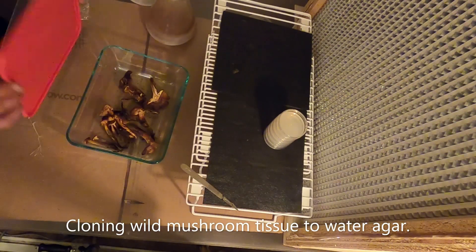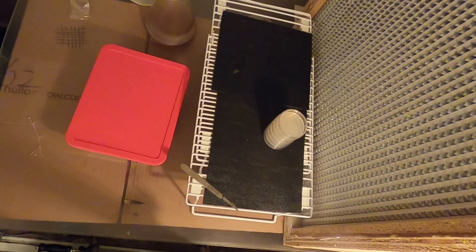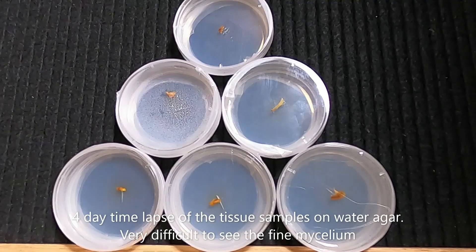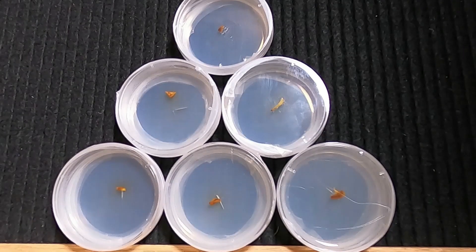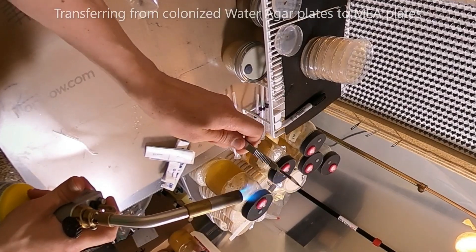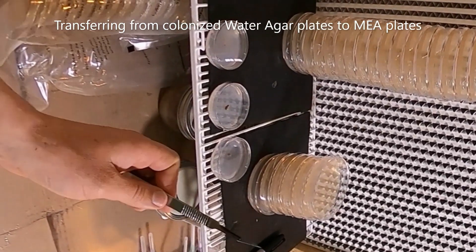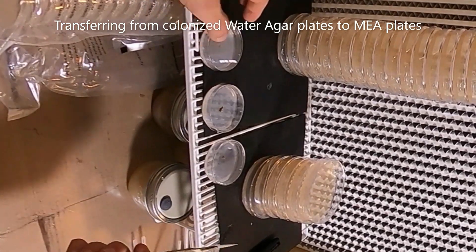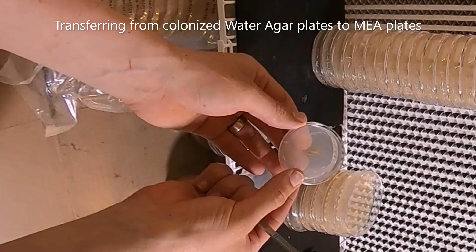We'll watch these over the next few days and see how they turn out. This time-lapse is very difficult to see. If you look at the middle right plate, you might be able to notice some of the growth. The mycelium is very fine, transparent, and wispy — it's very difficult to see. After four days, we'll examine those plates for contamination, save the best ones, and move those on to nutrient media.